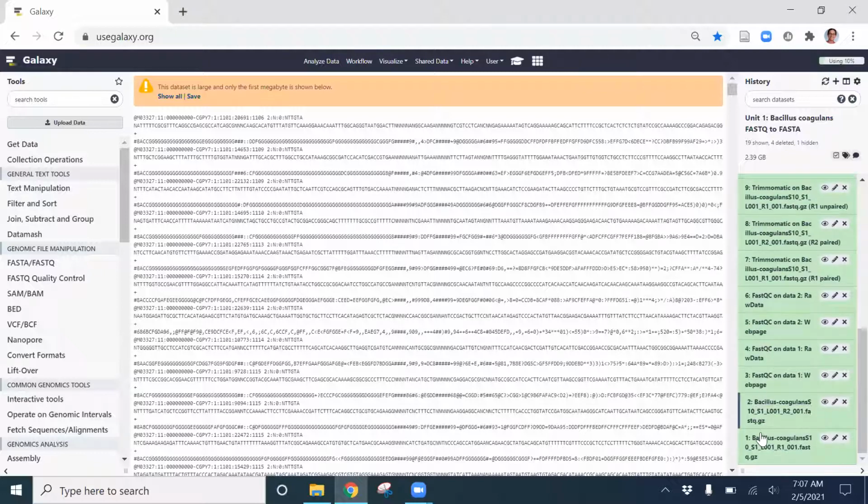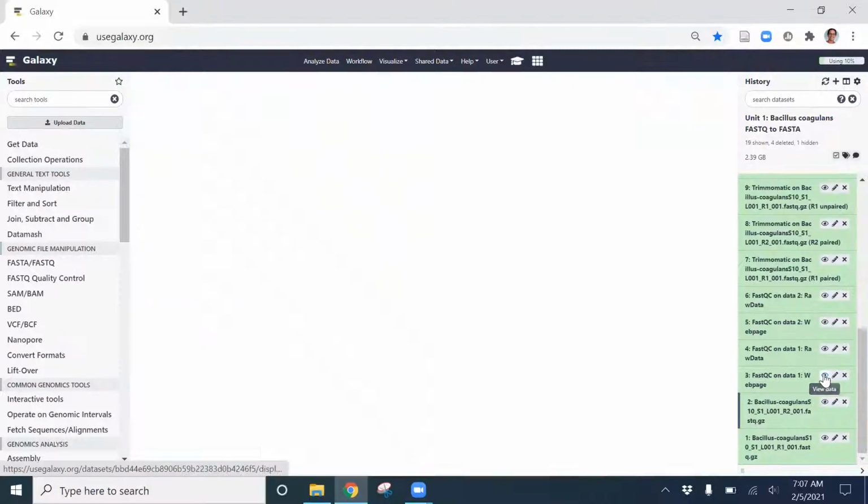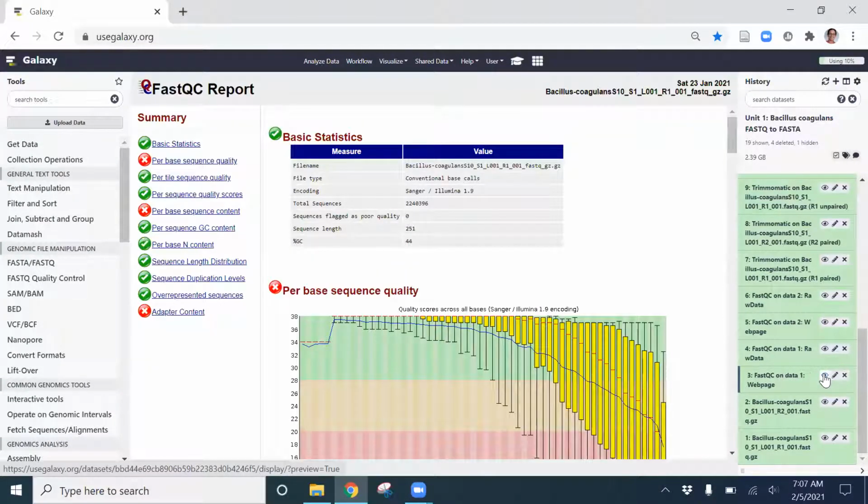Once you have those 2 files there, you'll run FASTQC, and you'll see that our data, because we did long reads for the Illumina system, we did 251 base pair reads, starts off very high, but as we keep going with the sequencing reactions, we run out of reagents, spots on the flow cell get out of focus, mistakes get made by the polymerase, and individual spots in a cluster get off track from each other. And so lots of different things contribute to the quality going down as we move along that molecule.